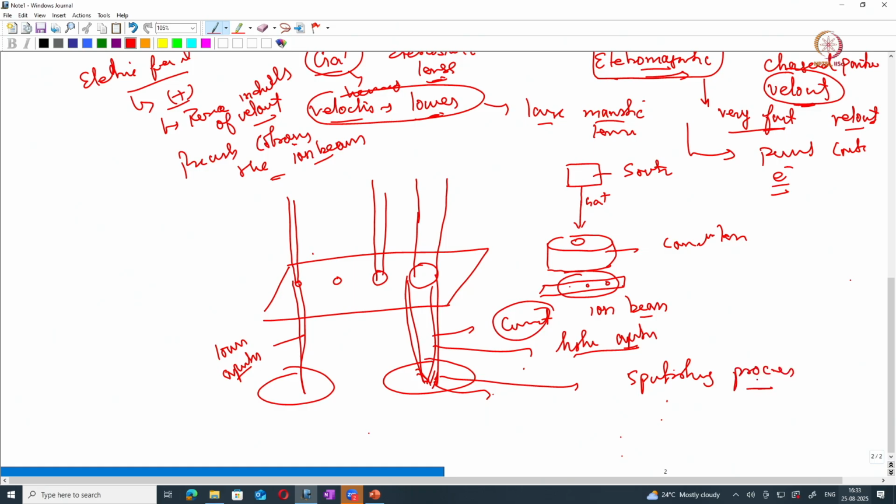Okay, so the ion beam current can be selected by the beam defining aperture below the condenser lens. This is the aperture strip with different sized circular holes called apertures. The larger the aperture, the larger the ion beam current, and the higher the velocity of the sputtering process.